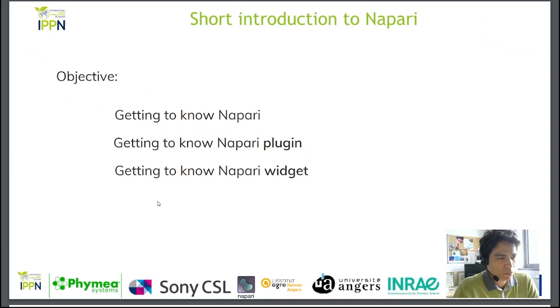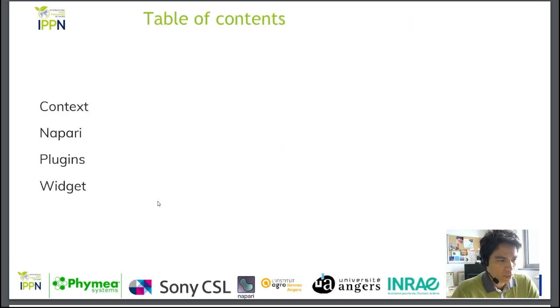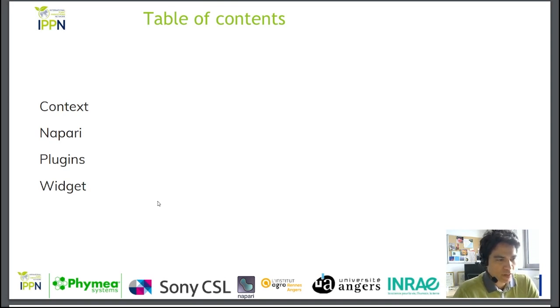So let's move straight to the subject of the video. What is Napari? Napari is an n-dimensional image viewer. These images can be manipulated using plugins — tools to help you process or analyze your images. We will look at these three points in this video. To explain things better, I've given this video a structure, divided into four parts.